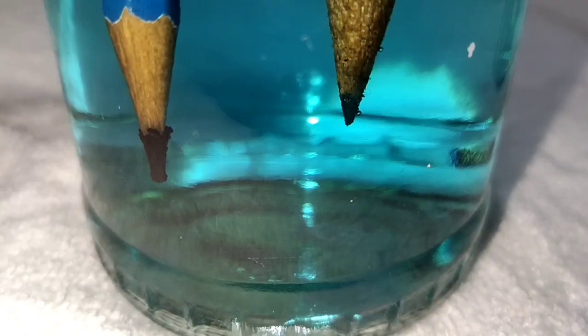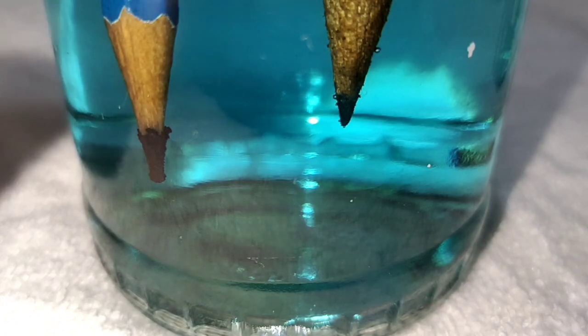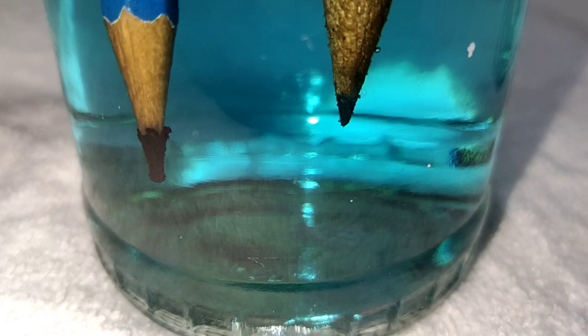So for our observation, there will be 3 observations made. First is the air bubbles will appear at the anode, which is our oxygen gas. This is our anode, and the brown precipitate will be formed at the cathode, which is the copper metal, and the third one is that the copper(II) sulfate solution changes color from dark to lighter blue.